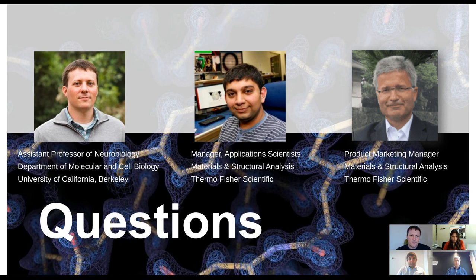Okay, and maybe same question. The concentrations of the nanodiscs, were they too high? I think they worked quite well. That's actually how they do look, high. We like to have the particles tiled quite closely on the grids. We find that it gives us thinner ice and makes processing easier, actually.